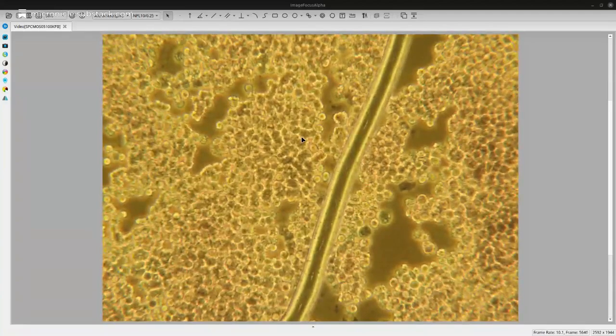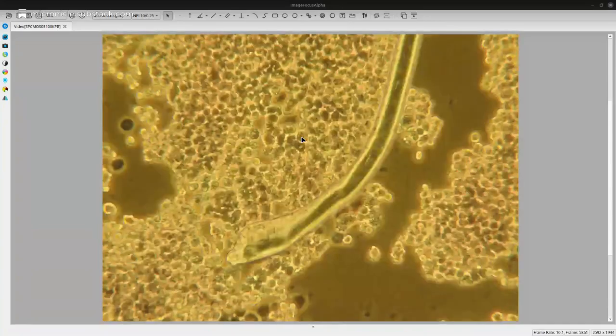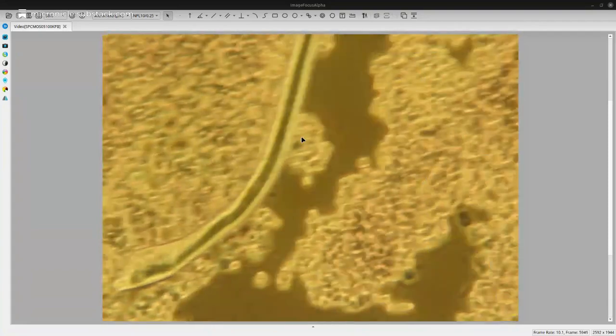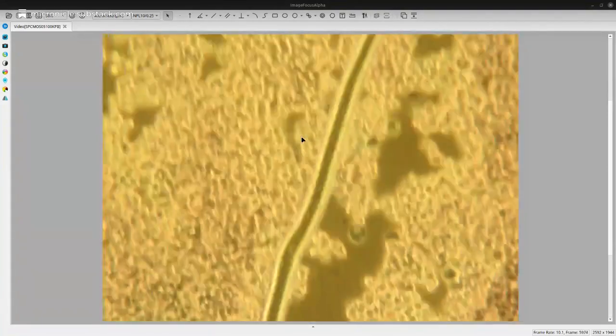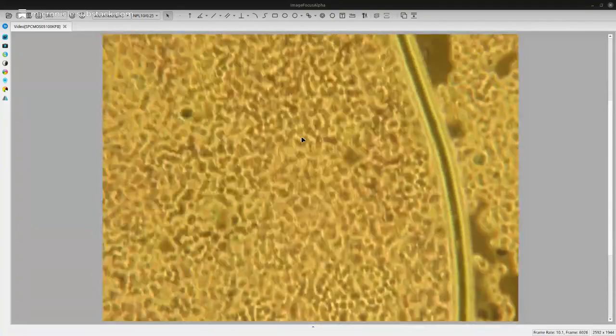I've seen fungus actually growing in a previous pus sample before, and so this hyphae, it looks like a hyphae, which may be growing a sporangiophore on the top, maybe. Oh, this is the sporangium. No, I get all my terminologies mixed up. It's too many to remember. But I'm just going to follow this all the way up.